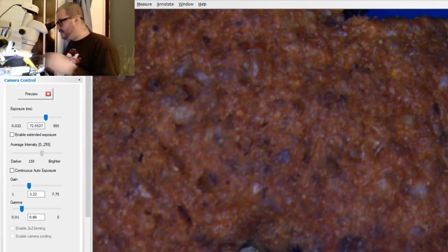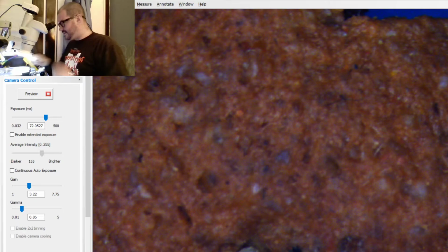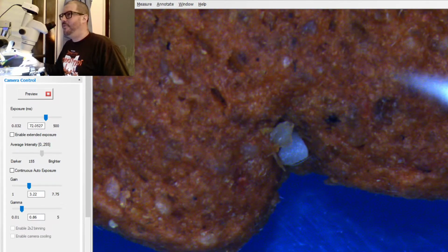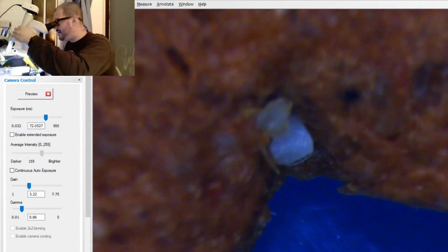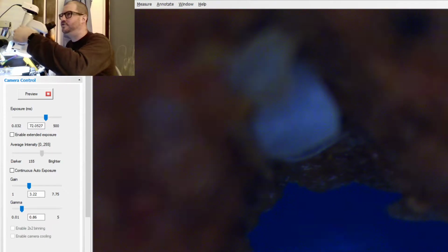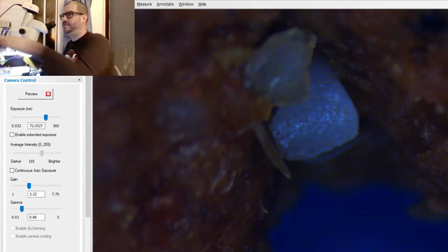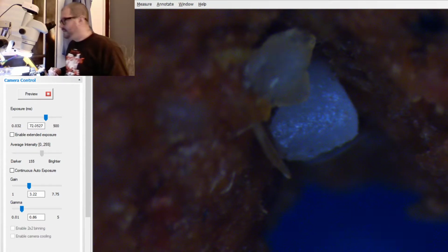That's all right. But anyway, this is actually really neat. I'm going to use a pair of tweezers just to move this thing around right there. That is really neat. What is that? There's a thing there. There's a thing lodged into it. Let's zoom into it at around 20x or so. What is that? There's a thing.